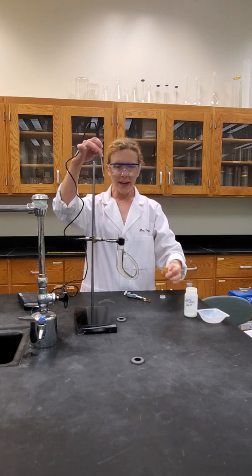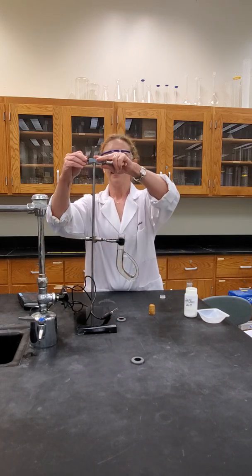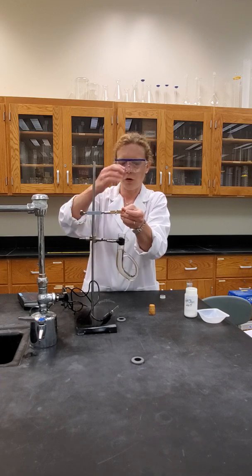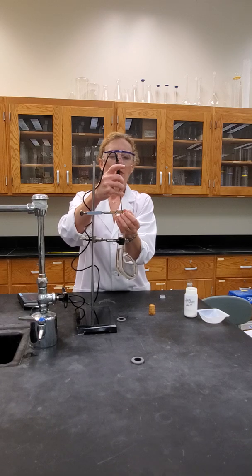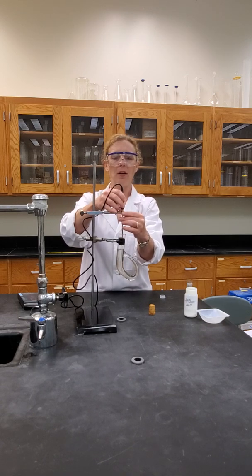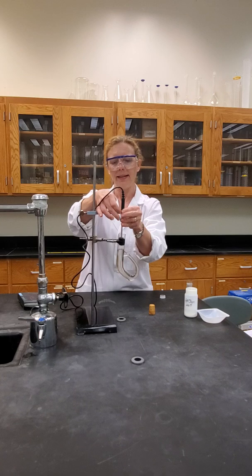Now, how will we stabilize this inside of here so it doesn't fall to the bottom? Well, I would suggest utilizing a thermometer clamp. And then you can just adjust this as need be. And I'm just going to increase the grasping ability. And it's up to you. You could just lower the probe into the area. I wouldn't support it with the rubber band. Either support it with that, or we could actually hug the rubber portion of the probe, and that probably will be a little more stable. I'm just going to tighten that nice and snug.